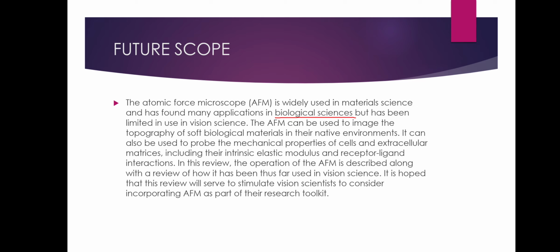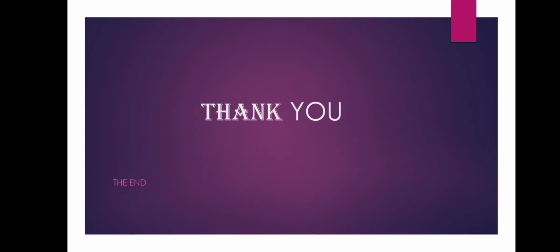However, the complexity of challenges remains open, and the oxidation process of the sample is still complicated. So there are some complications in the AFM, and one or a few drawbacks of this microscopy may be overcome in the future. So it has a great future scope in science and many other fields.